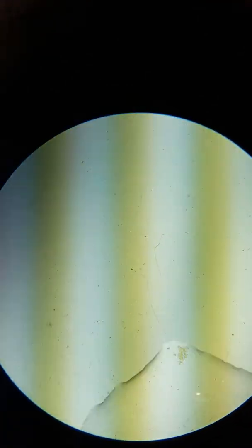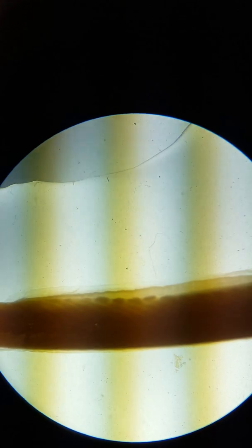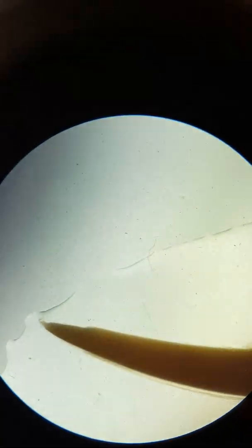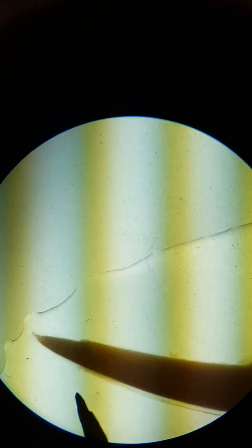If I look at a slightly different specimen, this one's mouth and tail is a little bit harder to see.